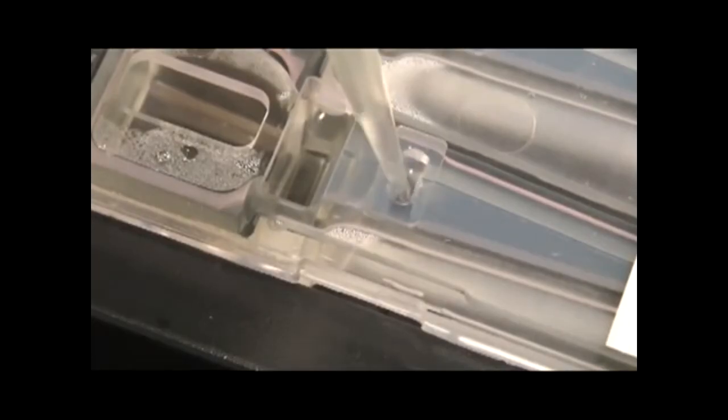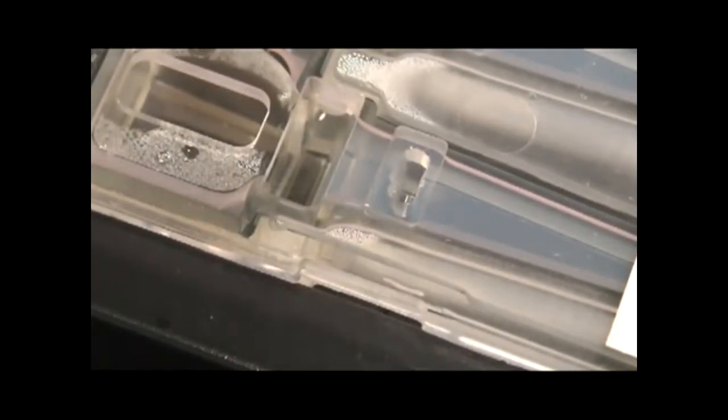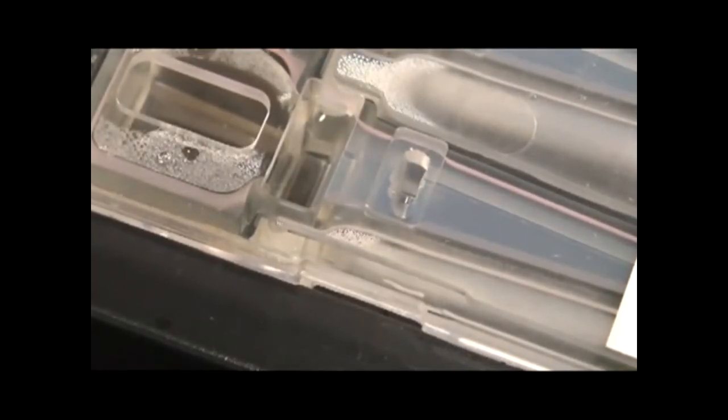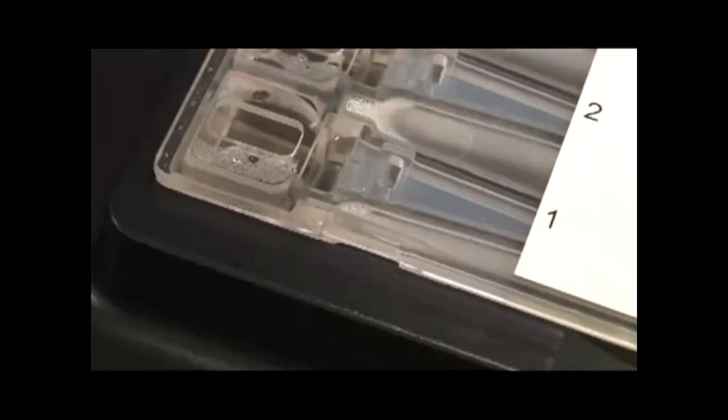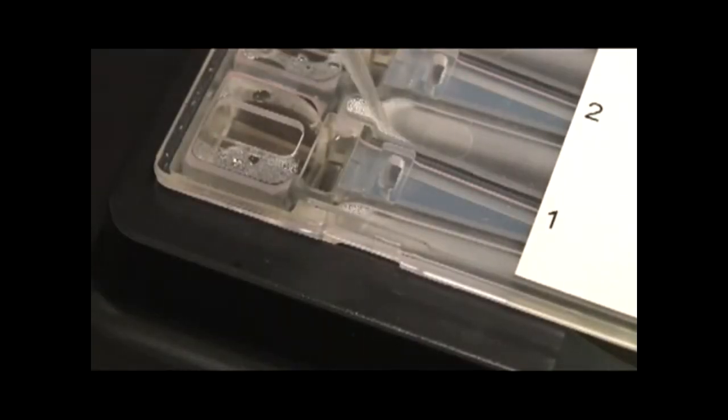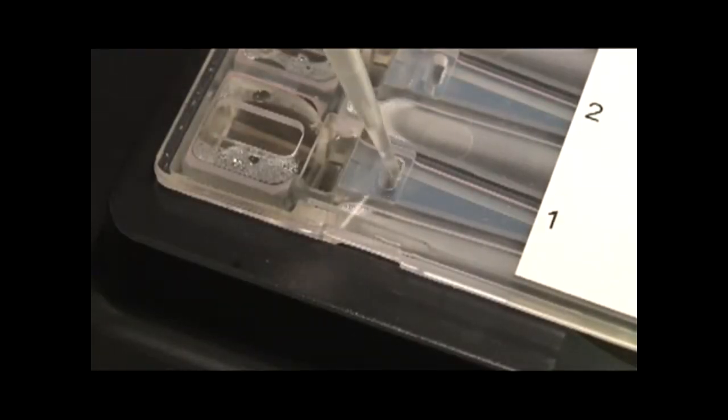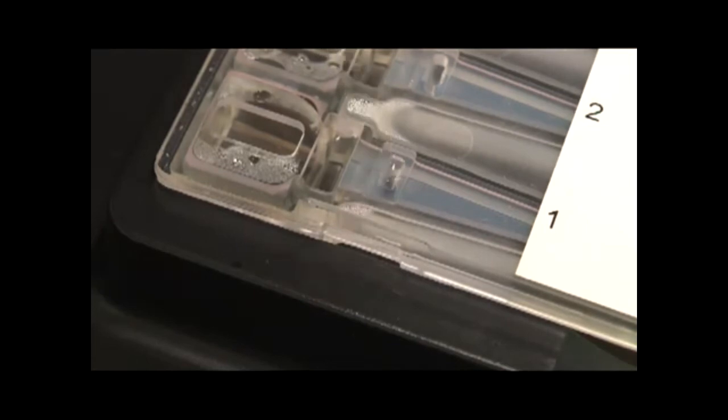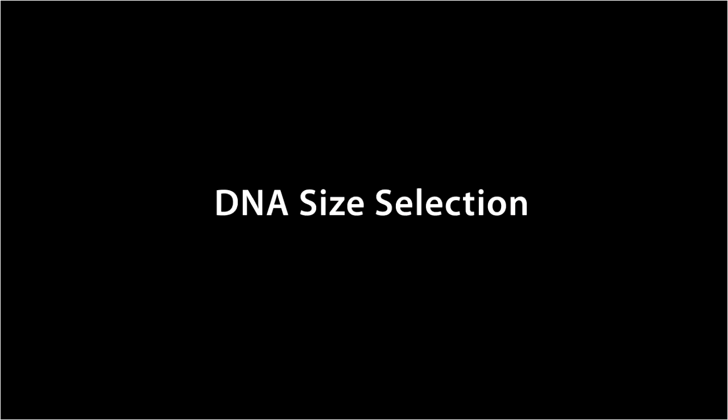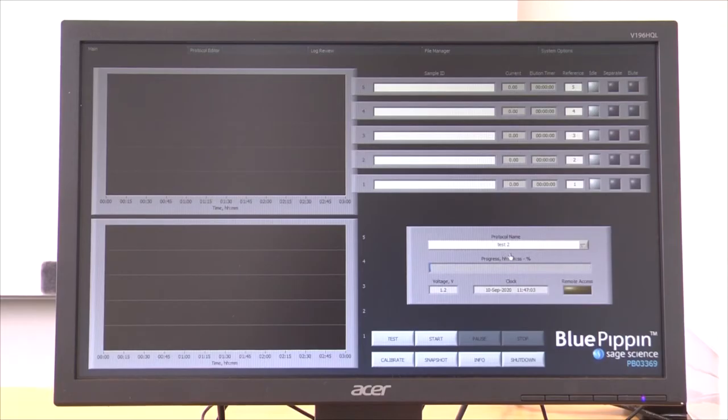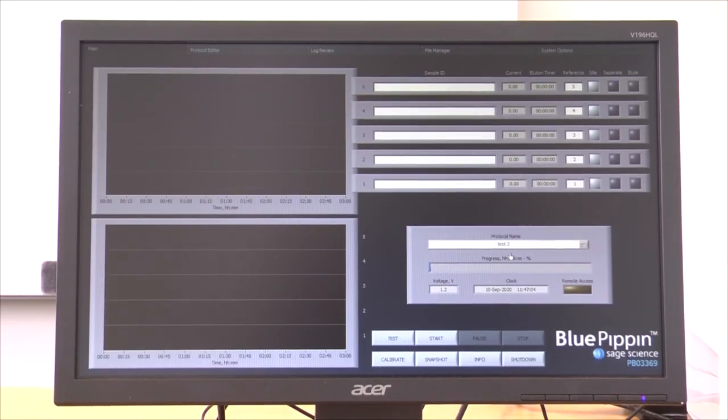Samples are loaded by first removing 40 microliters from a sample well and then adding 40 microliters of the sample to that well. Then the lid is closed and the run initiated.